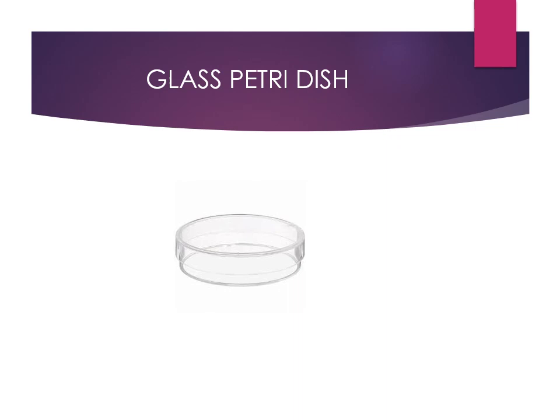So there are multiple questions that can be asked. Like you have poured it, what conditions should you follow so that whatever you are pouring remains sterile? And how can you check whether the media which has been prepared is sterile or not? Whatever lot you are preparing, you put a single plate in the incubator, and next day after 18 hours you check if there is any growth without inoculating any sample. Then your media is not good.